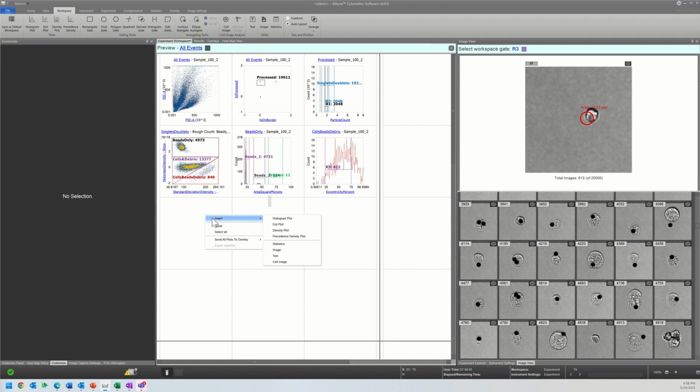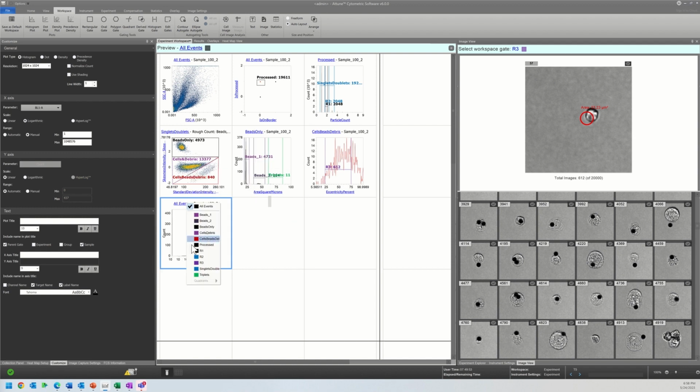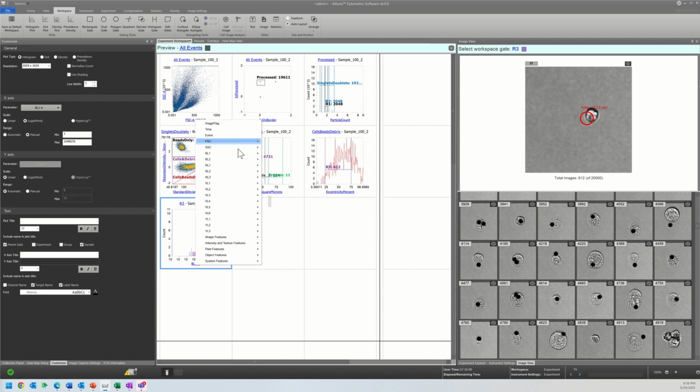And then I'm going to plot this against my live dead. BL2? No, BL1.